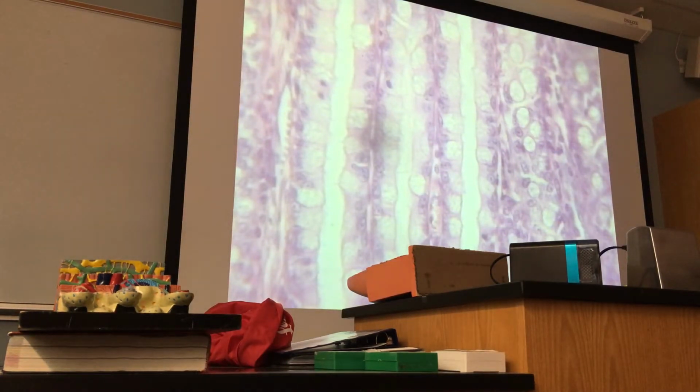But in the small intestine, the goblet cells shapes are a little different. Here you can see how huge the goblet cells are, and because of the content mucus, the staining is light because the mucus does not take up the stain that much. So the goblet cells here are lightly stained. All right, look at that. So you have to identify these two types of cells.